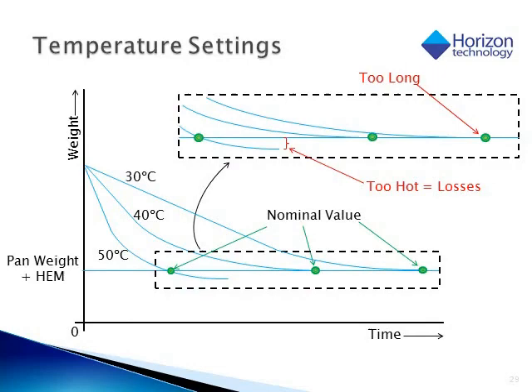The temperature setting controls the speed of evaporation. To get the process to go faster, many users turn up the temperature. But now what happens when the analyst looks away for just a second? All the hexane has evaporated, and now the light ends of the target analytes are being lost.